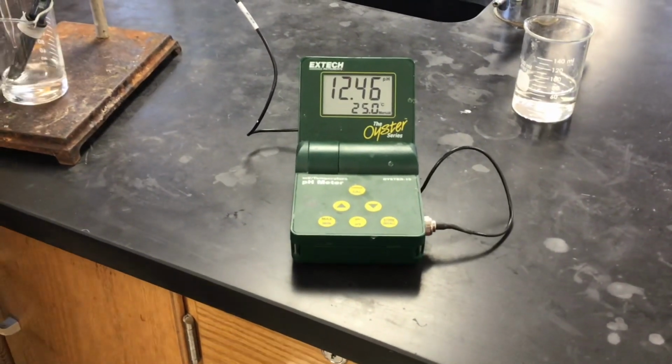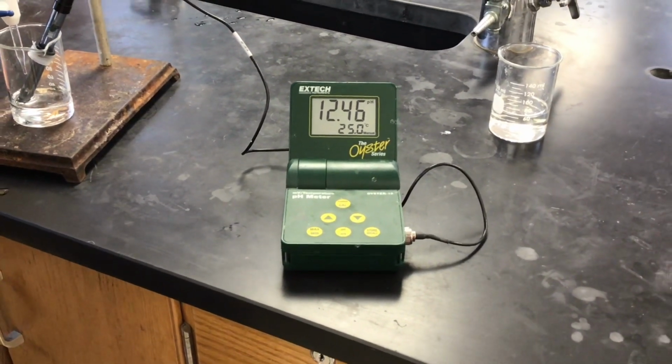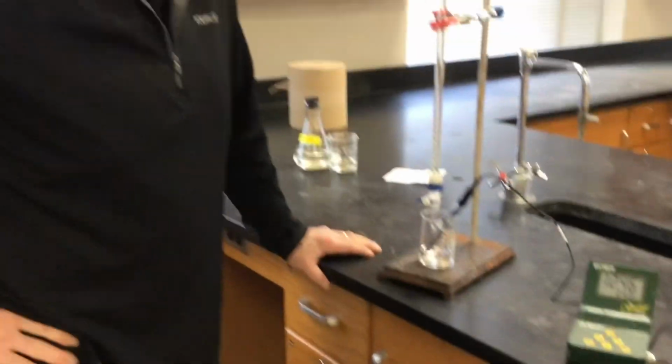And I think that's about enough. Yeah, that should work. Okay. So we're trying to find the concentration of this strong acid. Use that titration curve to help yourself do that.